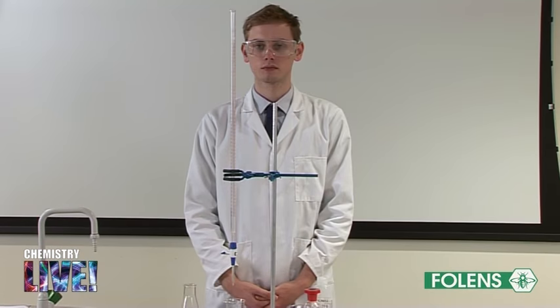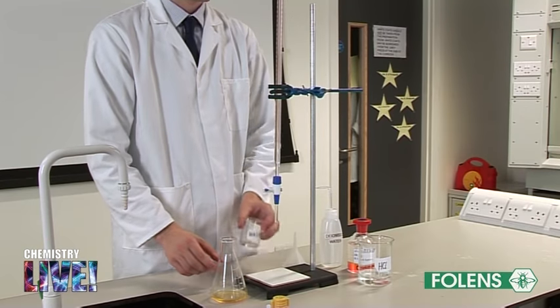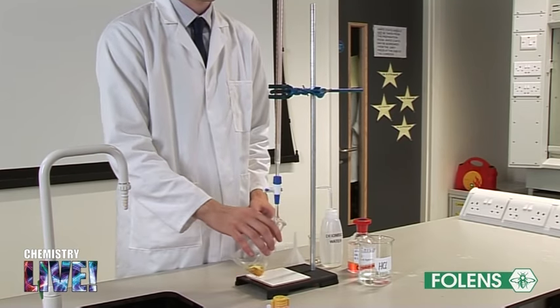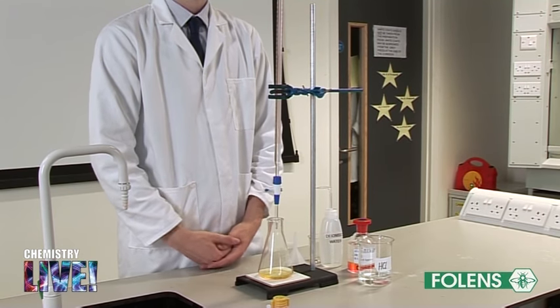For the sixth part of the experiment, place a white tile on the base of the retort stand and put the conical flask on the white tile. The purpose of the white tile is to enable us to detect colour changes more easily.